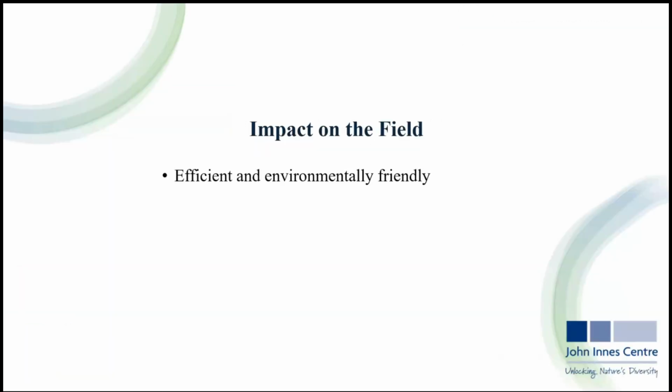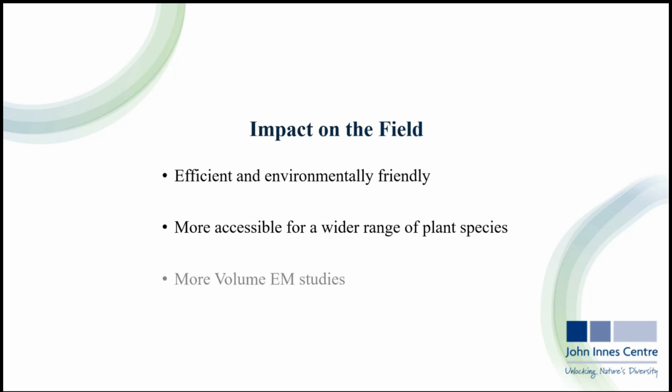So overall, this work can contribute to making plant tissue preparation for volume EM a lot more efficient and environmentally friendly. Whilst the BioWave's fixation still needs improvement, the faster processing time and reduced reliance on heavy metals does show great promise. So this method could make volume EM studies more accessible for a wider range of plant samples, including rare plant species, which have been a challenge in the past.